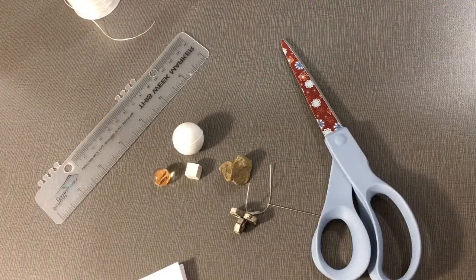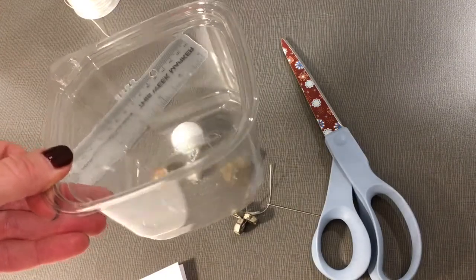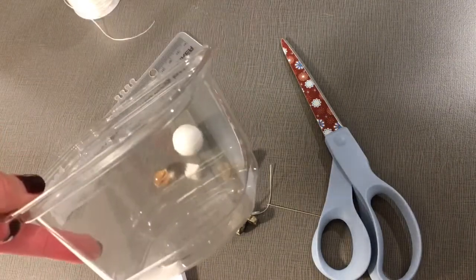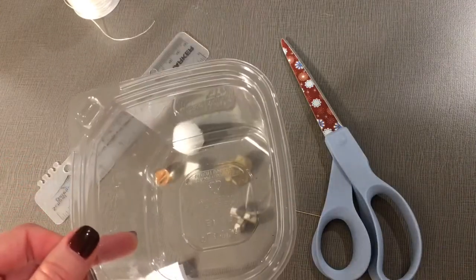Also, don't forget your measuring tray. You may have a different one that looks like this that you can use as a measuring tray.